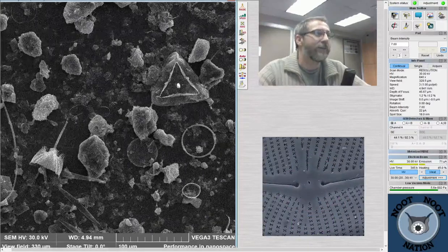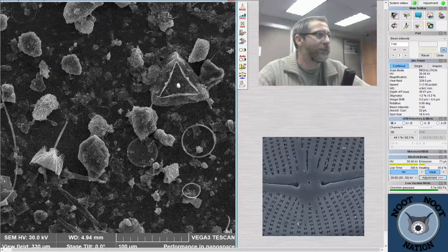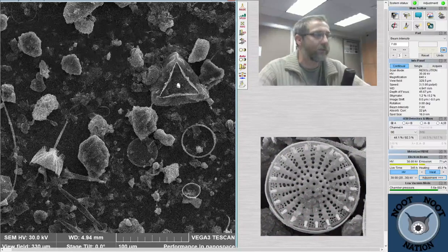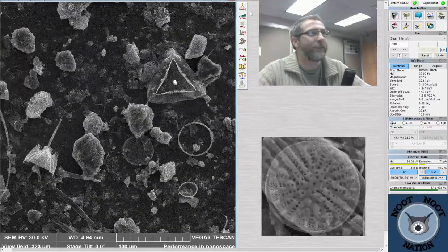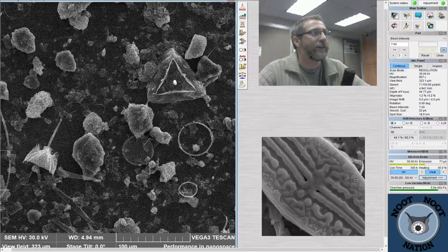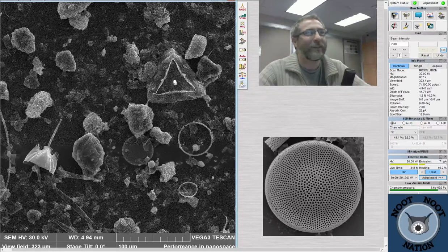And you're just looking at the valve face on both of these. There's usually some girdle bands that would then connect it to another valve that has the exact same shape. It would be pointing the opposite direction, right? And I am going to just go ahead and take a picture of this, even though I don't think it's a very great photo, because I think that having both of them in the same field of view is nice. It might be nice for Pacific Plankton if she's trying to showcase some things to people so that they can see both of them at the same time.